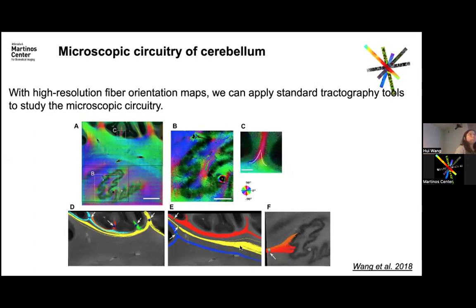It's because I assume that is a single 2D image. Yeah, that's a single 2D image. Yeah, it's also possible that there are other fibers coming through the plane and turning, so yeah, it's possible. I see that.